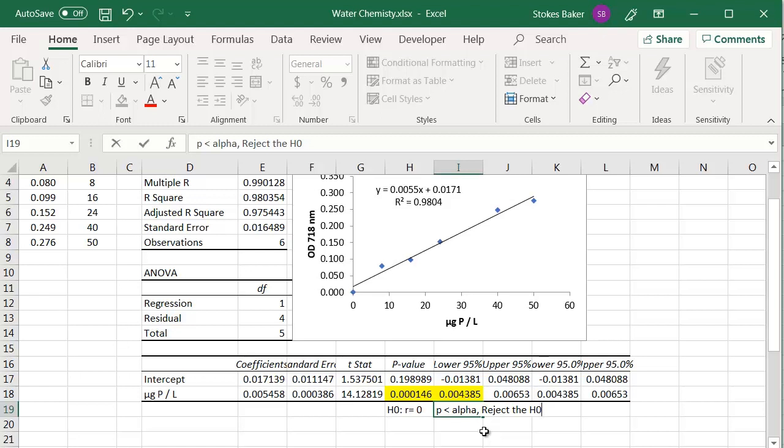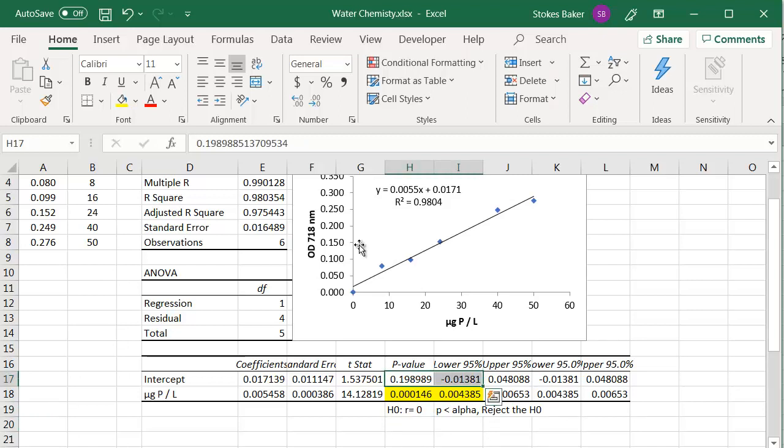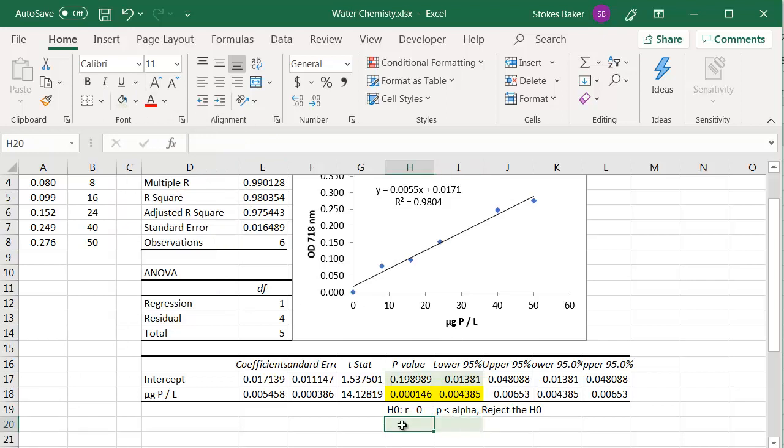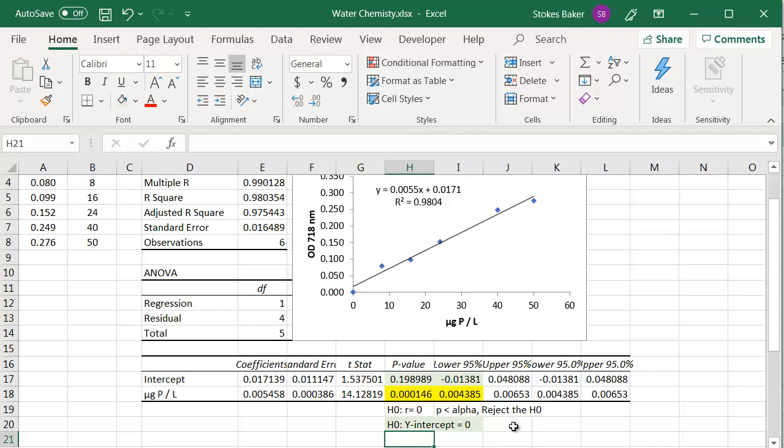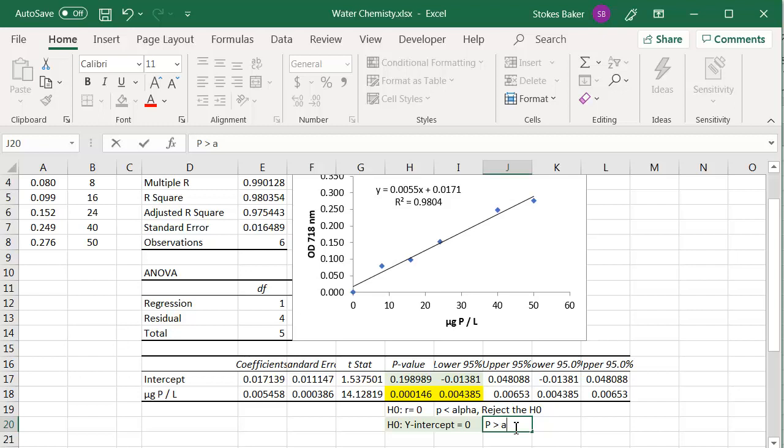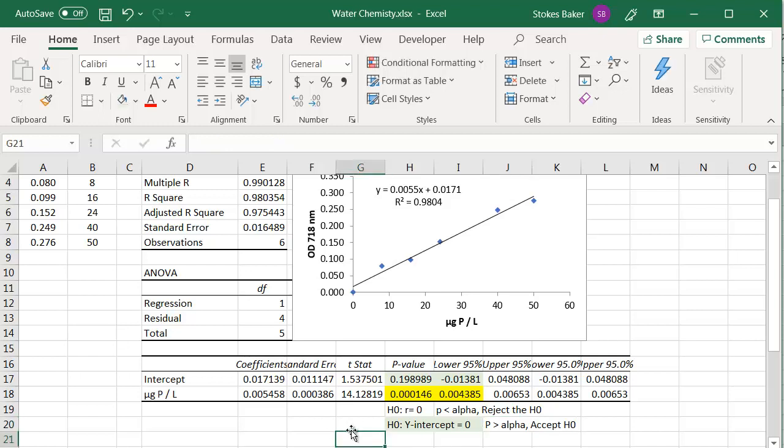Since this is a standard curve, we do want our regression line to go through zero. So to do that, we're going to look at these two values. And for this example, the null hypothesis is going to be the y-intercept equals zero. Since, in this case, P is larger than alpha of 5%, for example, we're going to accept the null hypothesis. Which is exactly what we want.